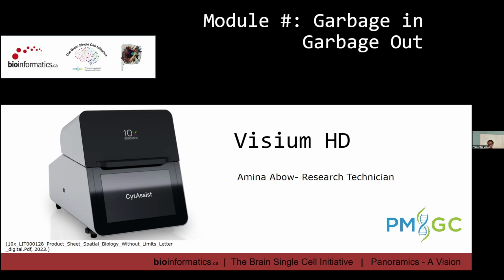I know that this is a bioinformatics conference, but I'm hoping that giving you a better understanding of the sample processing portion will give you a more holistic understanding of the Visium HD assay. So this module is called garbage in, garbage out, as referenced before. It's just referring to the quality of the data that you receive will be determined by the quality of the sample that you submit to us. And feel free to ask any questions at any time.